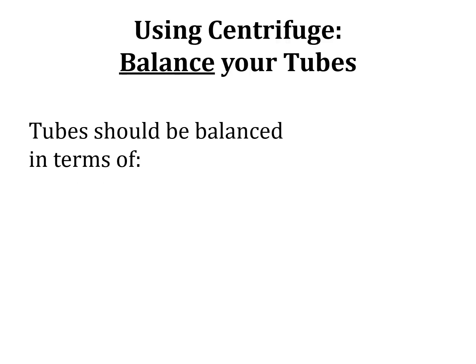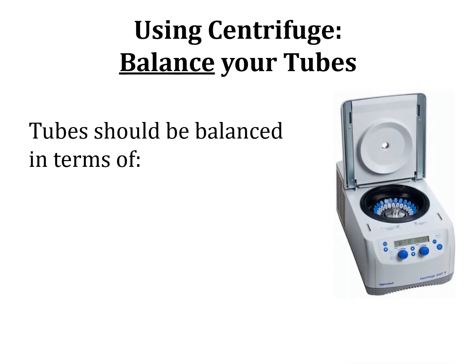So it's important for us to learn how to use a centrifuge. If we proceeded with this experiment, you would have used a centrifuge, so that would have been more relevant, but let's talk about the background. If we don't use the centrifuge properly, it will start making sounds. It will get damaged. So to avoid that, we need to balance tubes, test tubes, Eppendorf tubes.